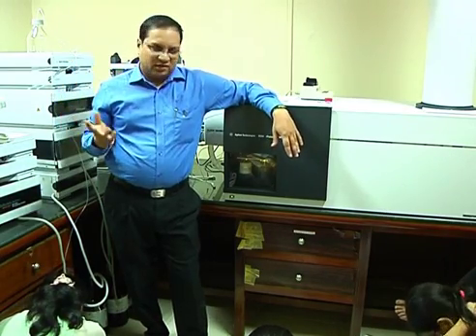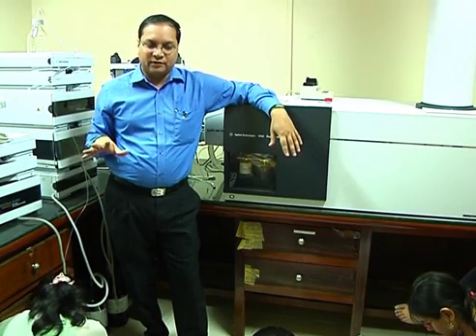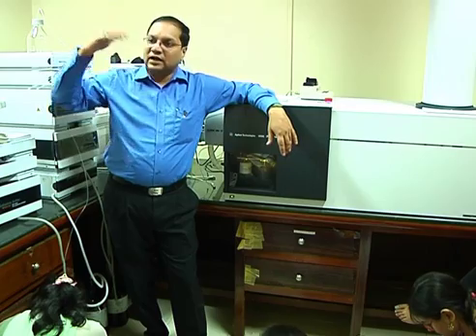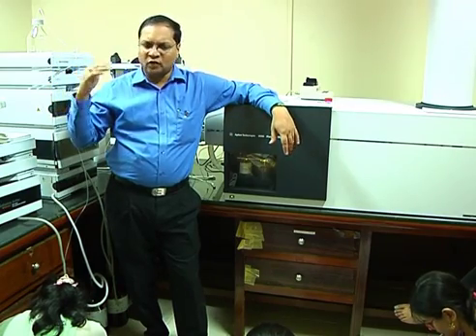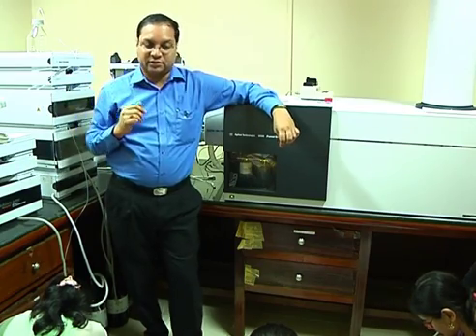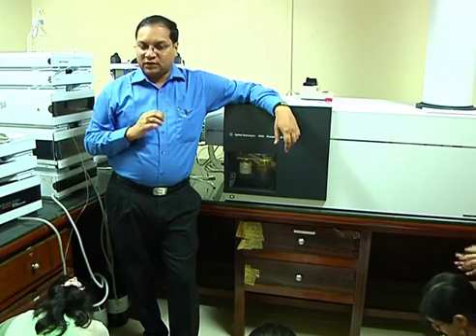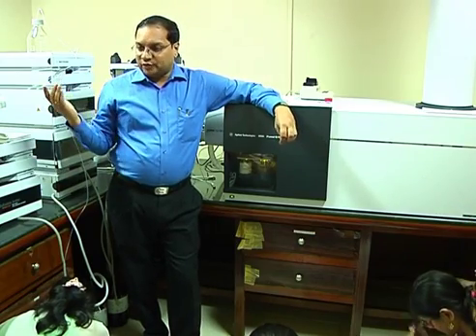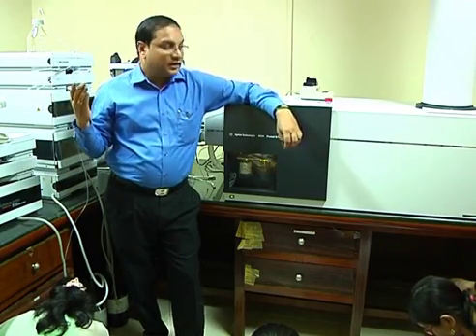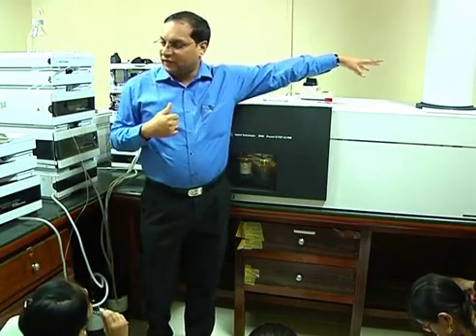That is one way. Nowadays, mostly no one is using that PMF approach because of the same simple reason that redundancy will rise. Based on only accurate mass might not be sufficient. You may have to trigger something. Then comes the other approach, which is called data dependent. In the data dependent approach, we take advantage of both the analyzers, quadrupole as well as time of flight.